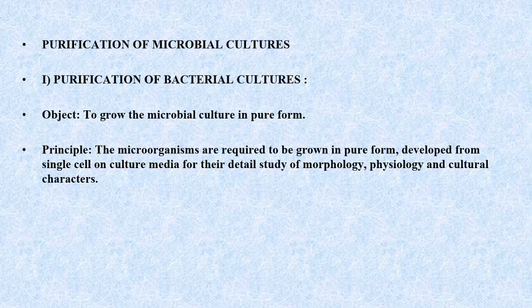Then when we isolate any bacteria or any fungus, sometimes there is contamination, meaning the desired organism is growing along with undesired microorganisms. It is called contamination. So in those cases we have to purify the microbial culture.